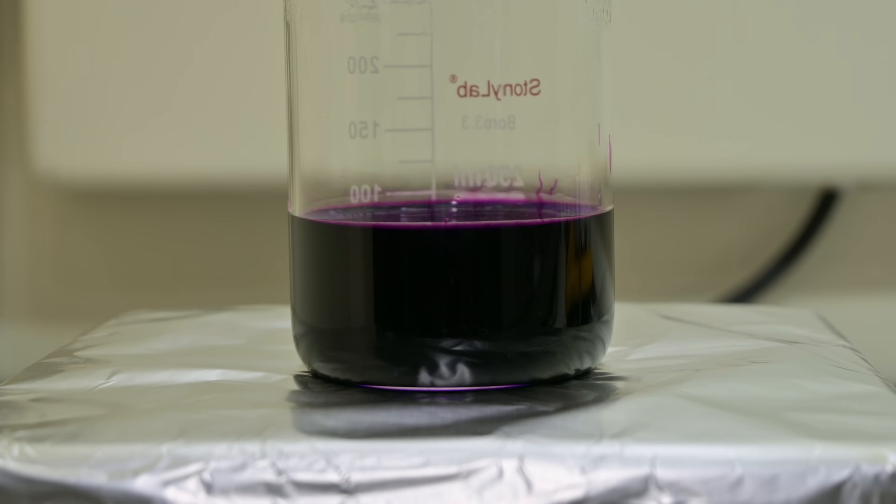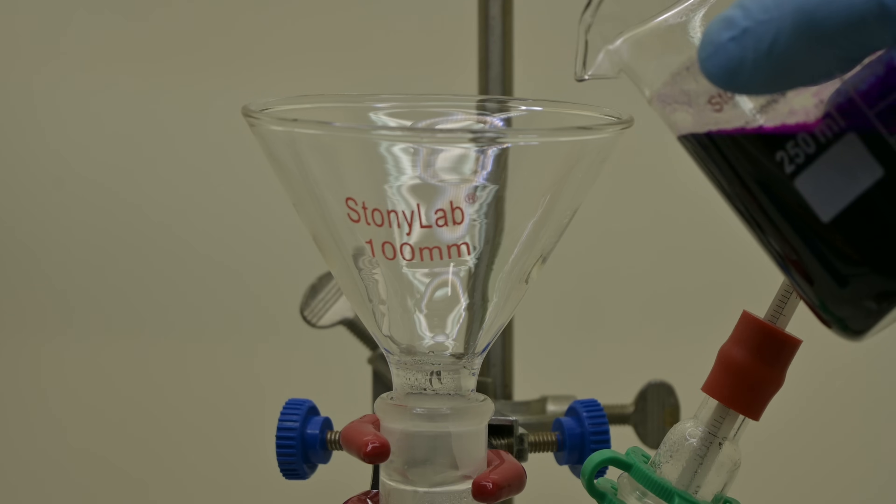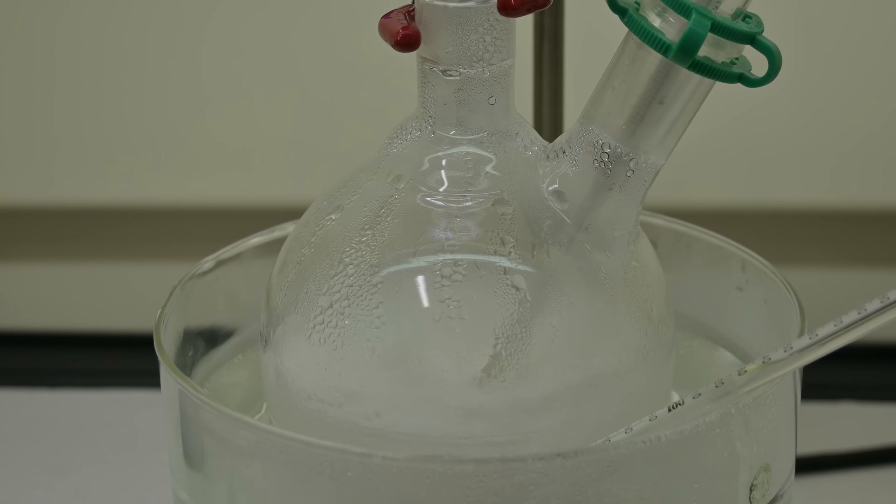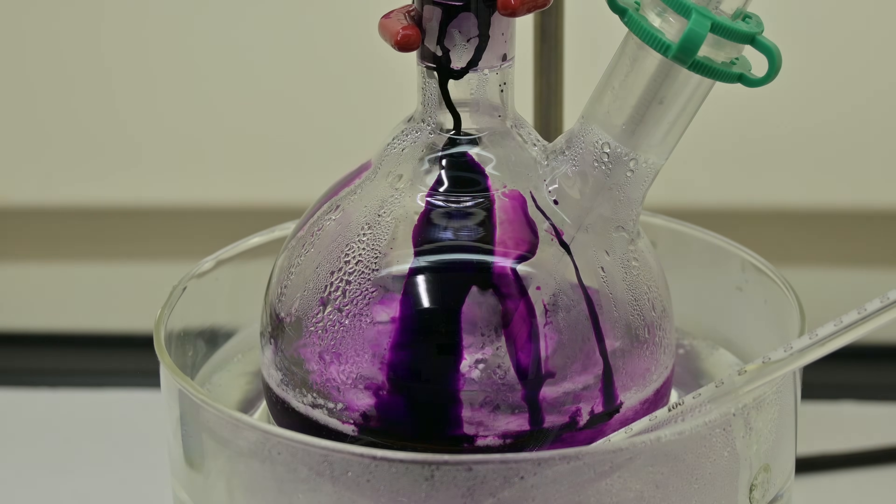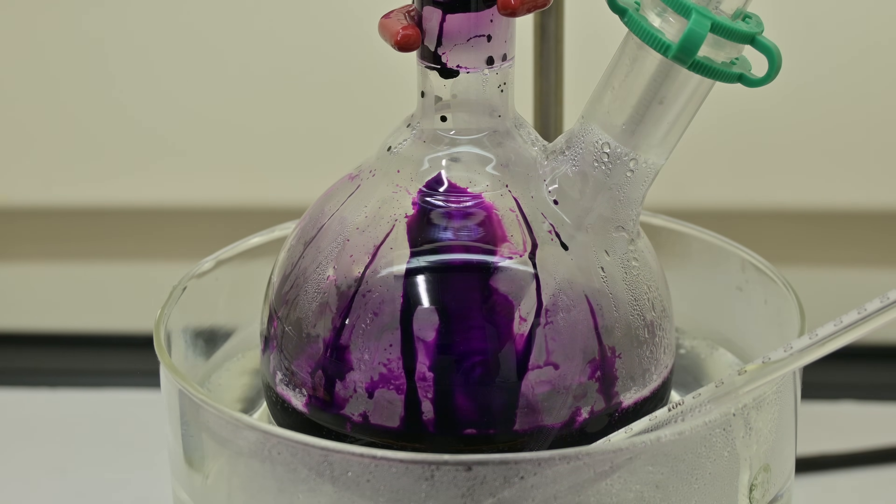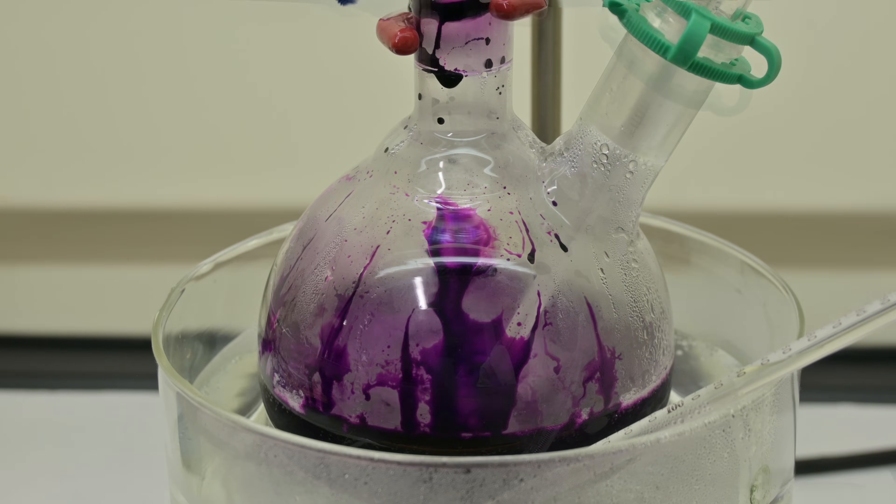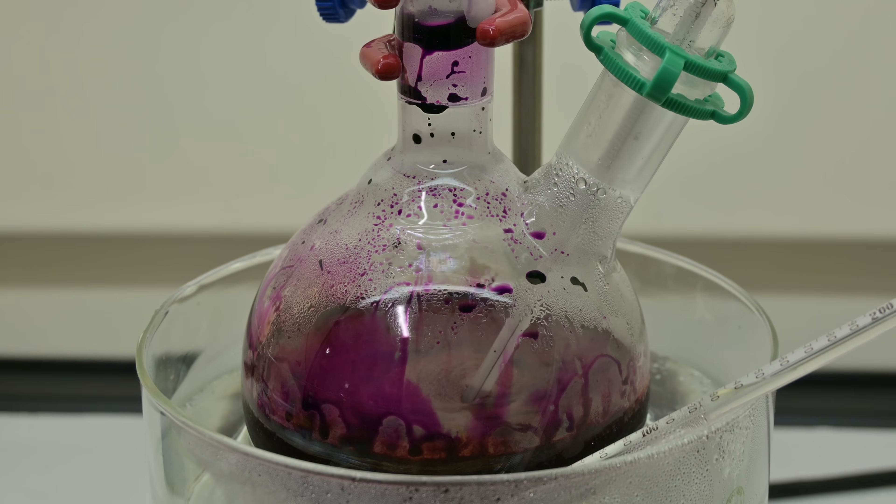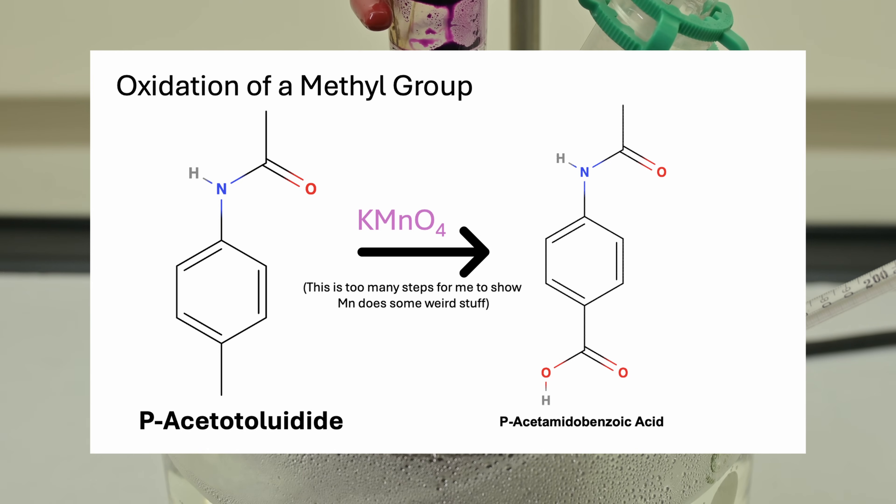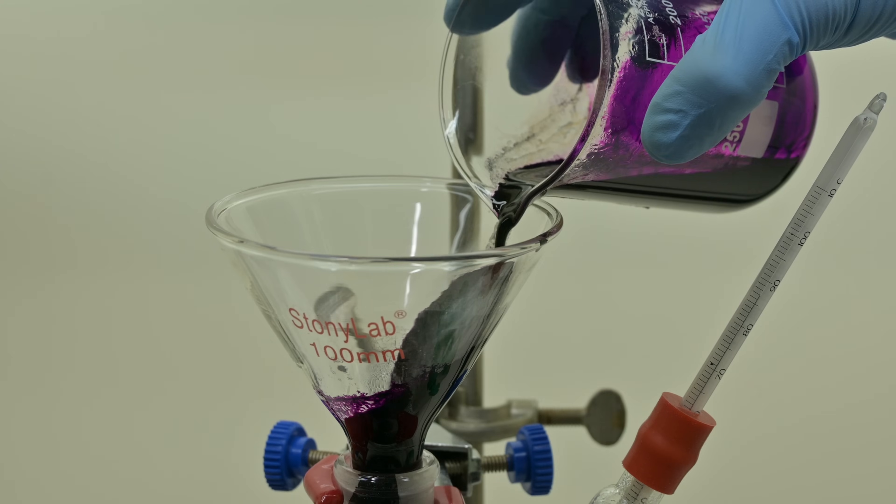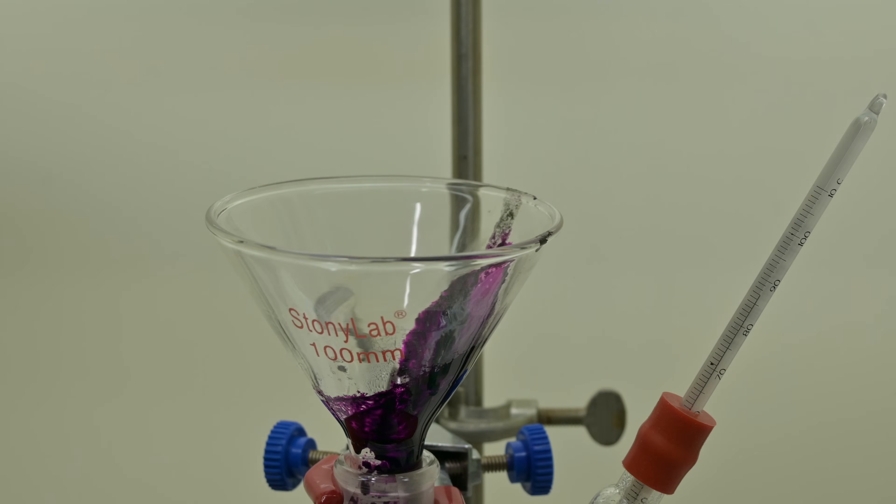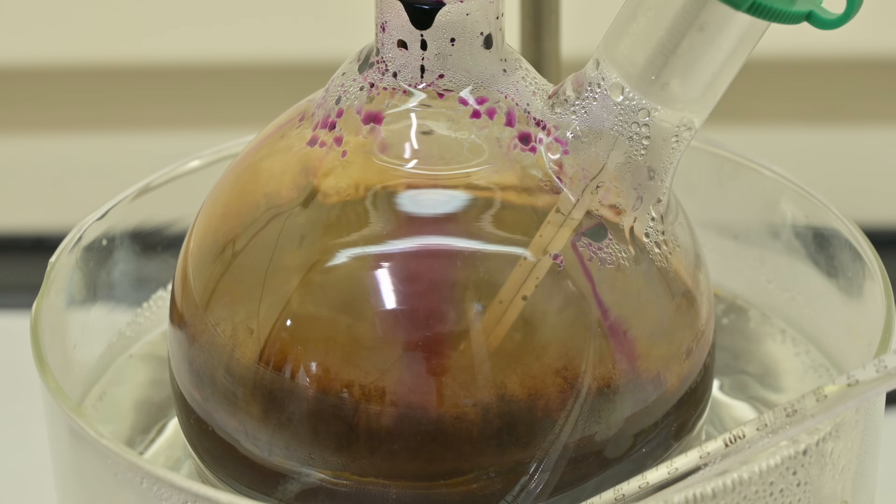Since permanganate can stain skin and destroy organics on contact, I'm making sure to wear gloves and goggles. Once both solutions are ready, I start oxidizing. I stir the hot p-acetotoluidide solution vigorously and begin to add the hot permanganate solution, a little at a time over the course of about 30 minutes. This part requires patience. Dumping it in too quickly risks over-oxidizing the product, essentially burning it up chemically and reducing our yield. So I add it slowly and keep things swirling to make sure it's evenly mixed, making sure the purple color doesn't build up too much at once.